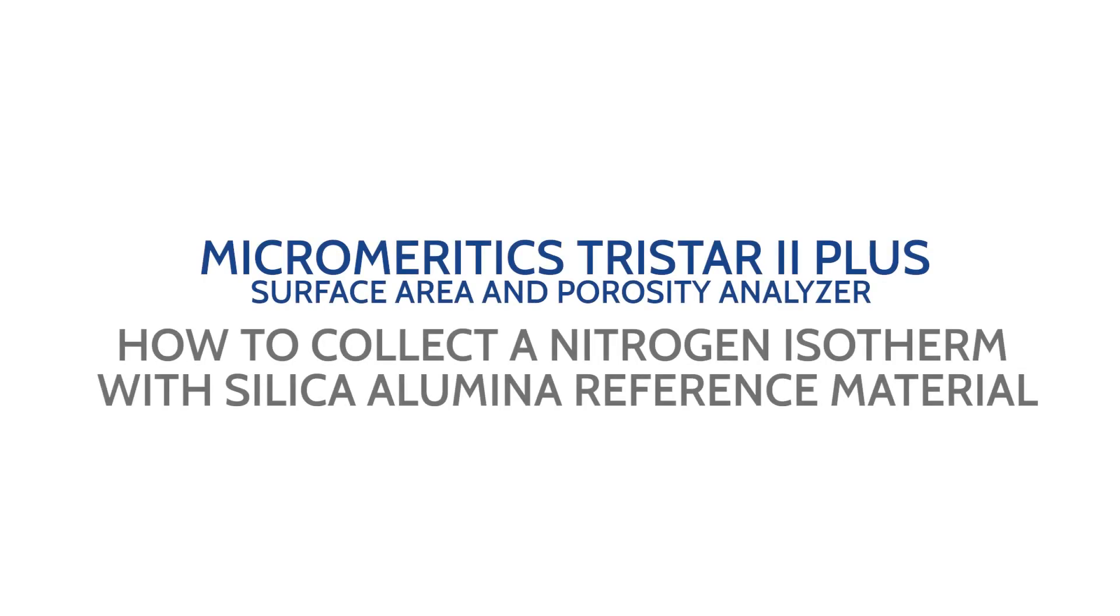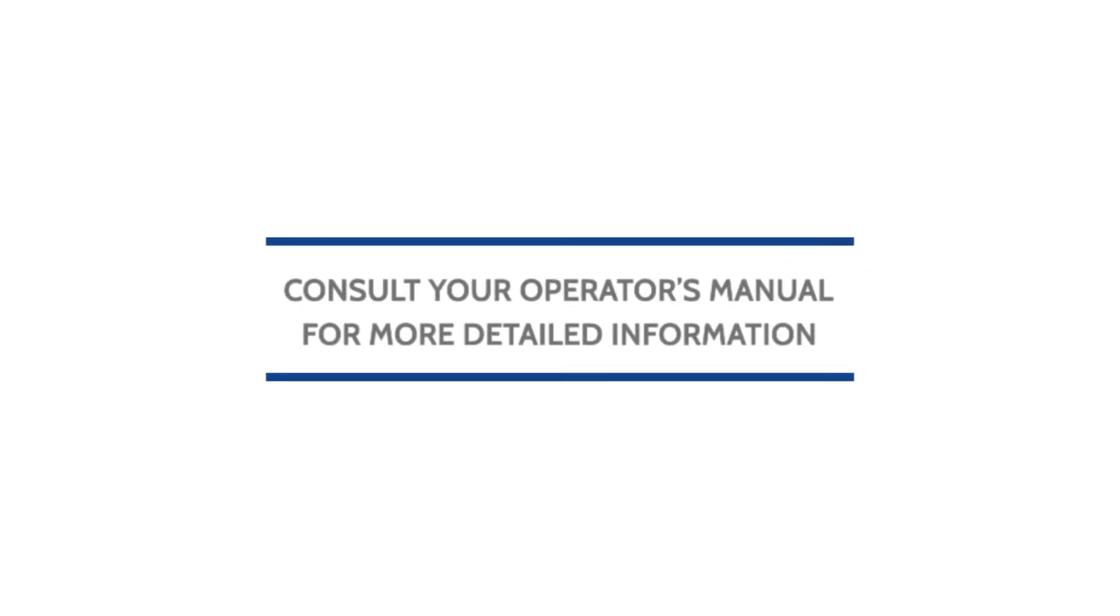This video will show you how to collect a nitrogen isotherm with silica alumina reference material on the Micromeritics TriStar 2 Plus Surface Area and Porosity Analyzer. Remember to always consult your operator's manual for more detailed information.